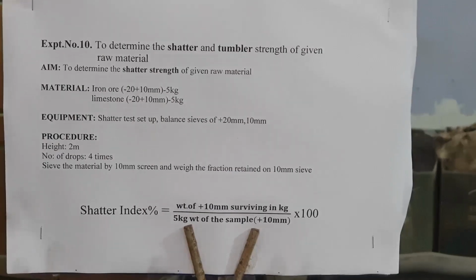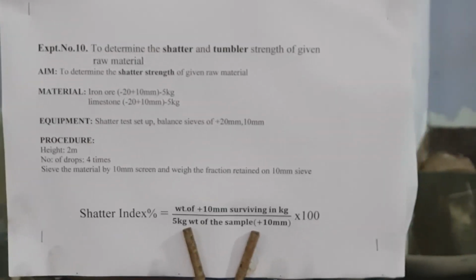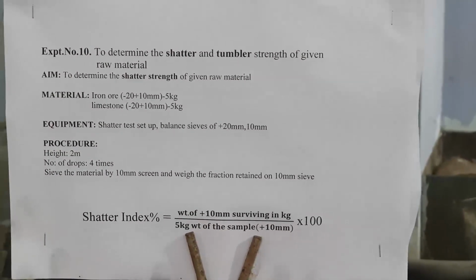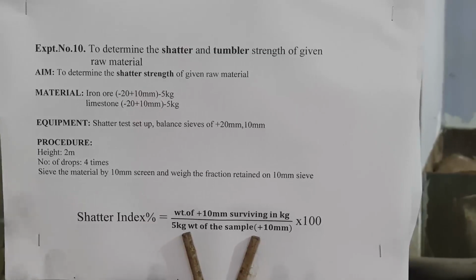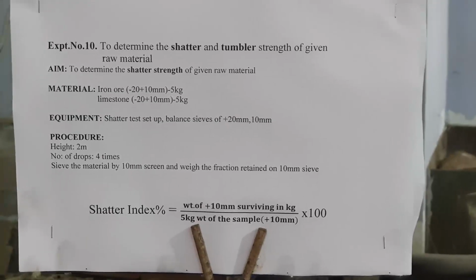This is experiment number 10. We want to determine the shatter and tumbler strength of the given raw material. In this experiment, we have to find out two things: one is the shatter index and the other is the tumbler index. We have separate equipment, a separate setup, for checking the shatter index and for checking the tumbler index.